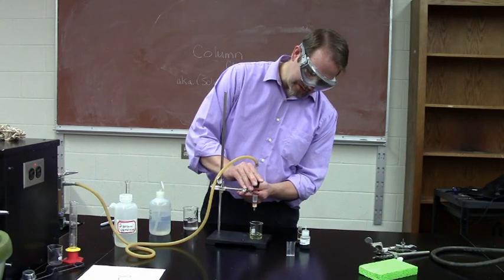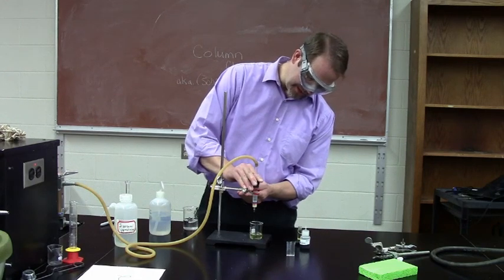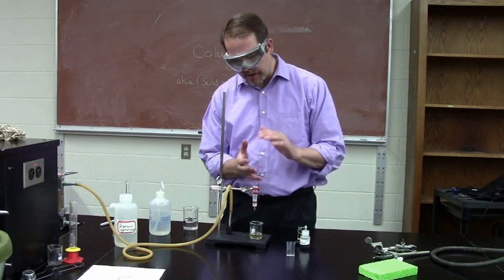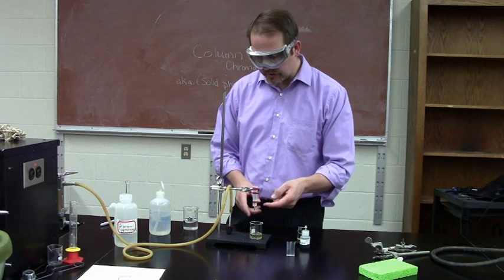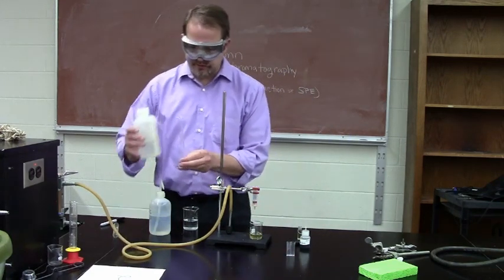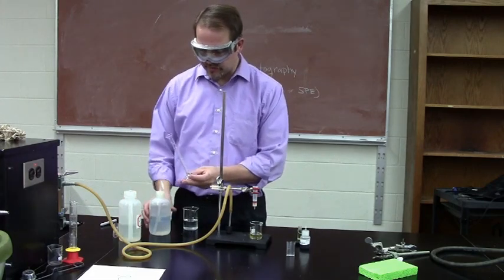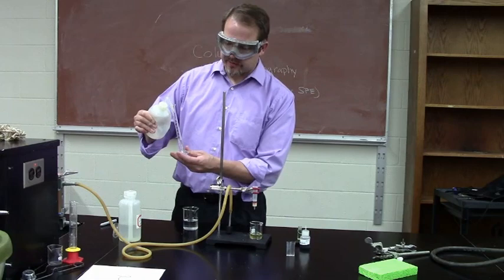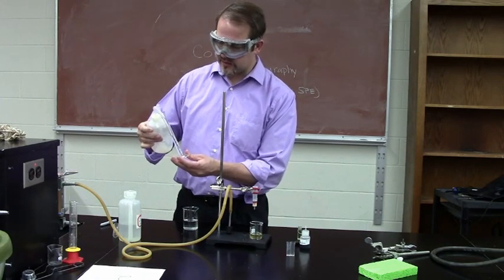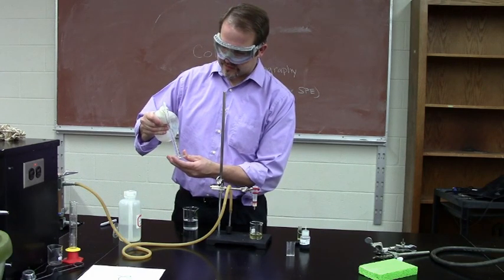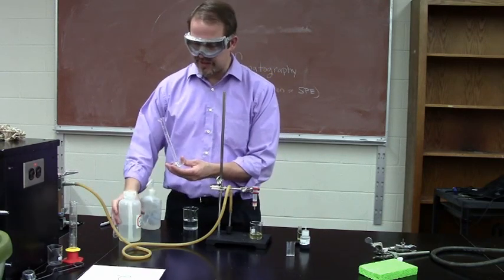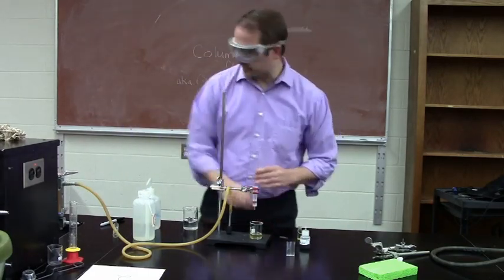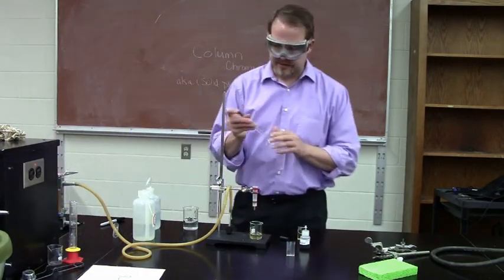So now that I've got the yellow essentially off, the red might be able to come off with the deionized water. But if we make the mobile phase more nonpolar, it will overcome the nonpolar interactions between the C18 cartridge and the nonpolar dye molecule. And so you can make a little solution of 5% isopropyl alcohol and 95% water. It's better if you go 9.5 milliliters of our DI water here. And then I'm going to add a little bit of isopropyl alcohol. Now it hasn't mixed very well, so maybe we could use a little stopper in here. And I can use the stopper and mix it up.